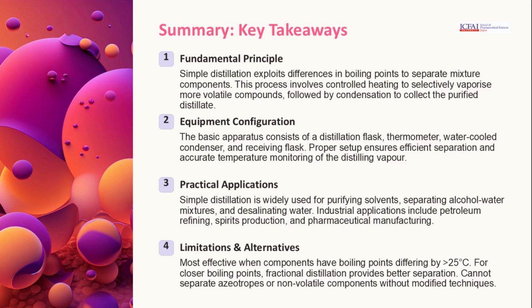Understanding the fundamental principle of distillation is key. It involves differences in boiling points to separate components. Proper equipment setup is essential for efficient separation. Distillation is widely used for purifying solvents and water mixtures. However, it has limitations, especially when components have similar boiling points.